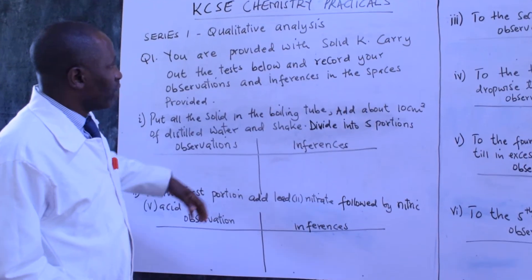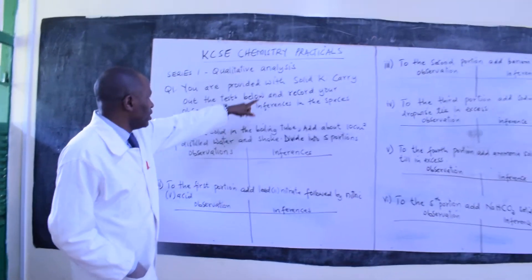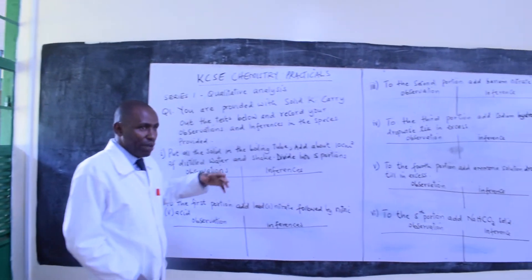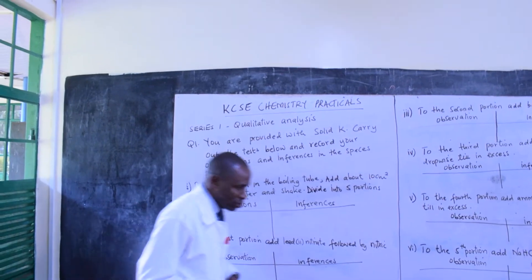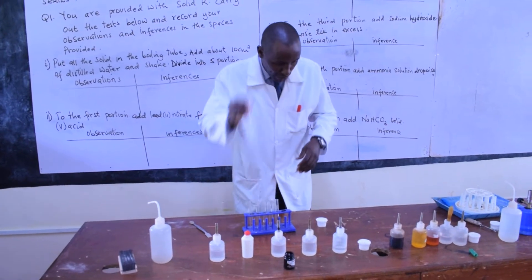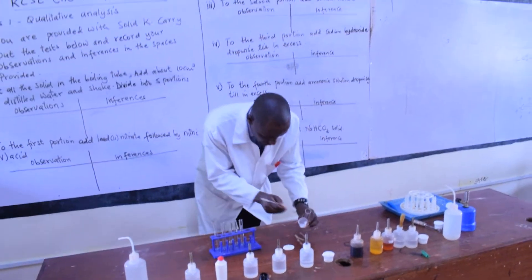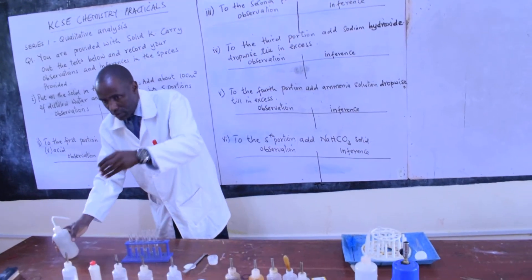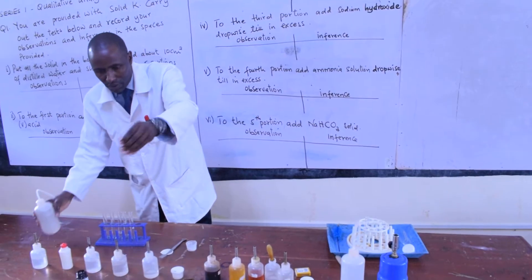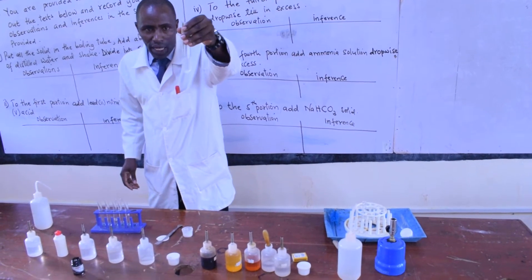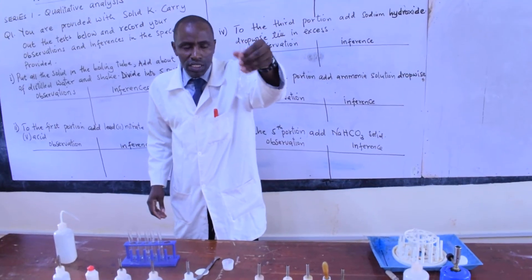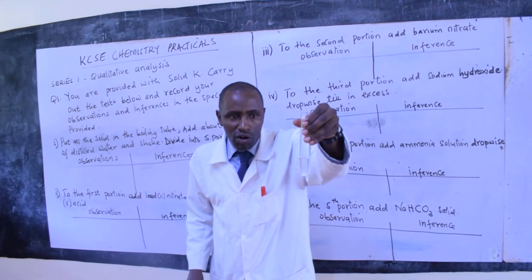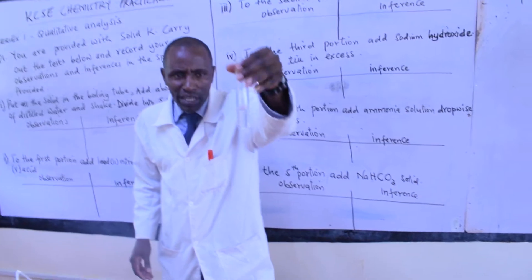We are given a solid K, and the first instruction is to add water to it. It's not automatic that it will dissolve, but it may dissolve — you are supposed to add the water to it. So, we have our boiling tube here and we have solid K. We are going to add the water. Whenever we add the water, what we need to observe is whether the solid dissolves or otherwise. It could dissolve, not dissolve, or dissolve partially. As you can see here, my solid has dissolved.